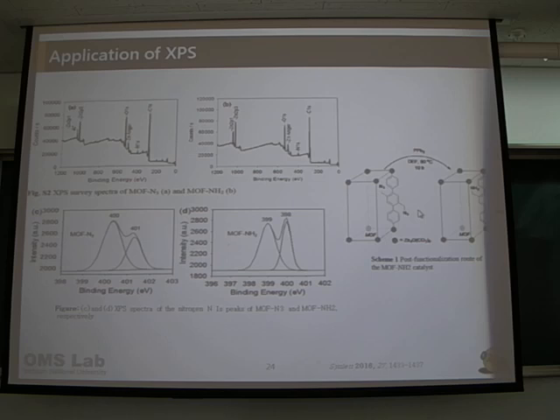In this case, this research group synthesized the amine compound from the azide. That means the azide group is converted to an amine group, and the final compound structure and the starting material structure, that means the composition, are similar.